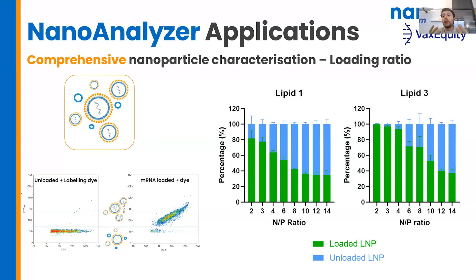This is a very simple way to understand what's happening with our particles — we have too much lipid and not enough RNA. The particles that we're forming are empty and can be less therapeutically active.